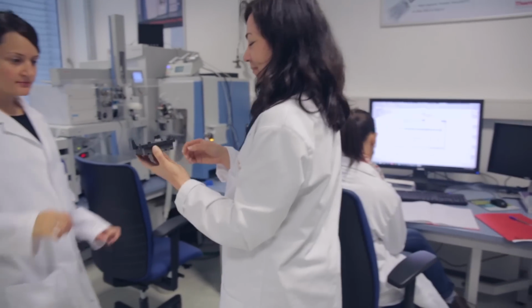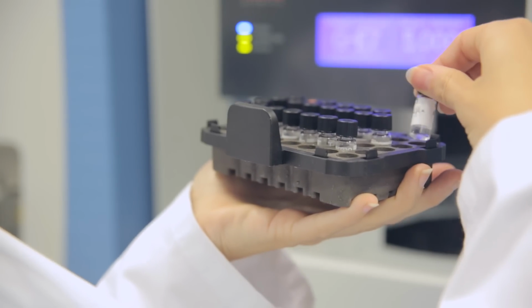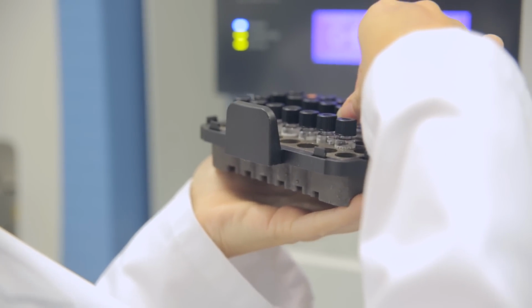Right now, within 36 hours, we are comparing 10 full proteomes, which means we're already under 5 hours that we need for a full proteome. The nice thing about using multiplexing right now is that we can increase the throughput at 2 different layers. One is happening on the mass spec side. On the other side, we bring in another layer by saying, okay, we can put in higher throughput through more multiplex channels. And so we're bringing this together, which really gives a big push in the throughput.